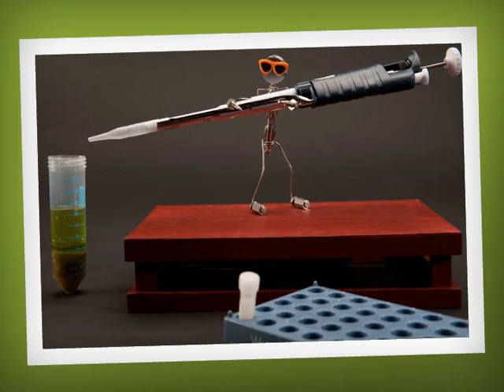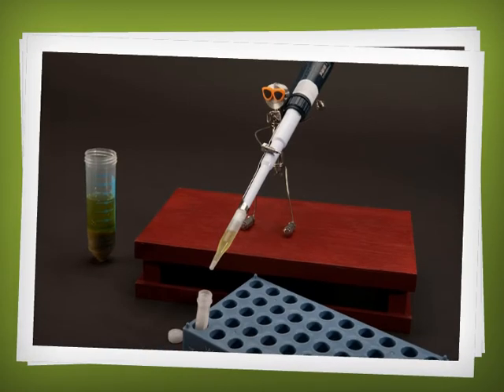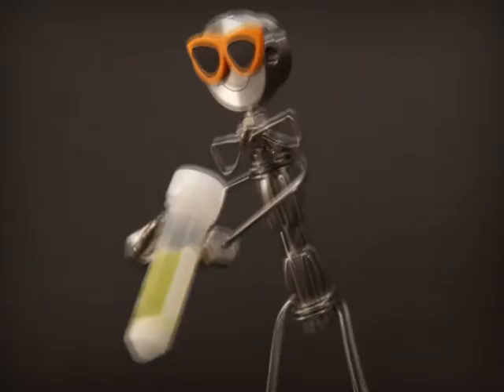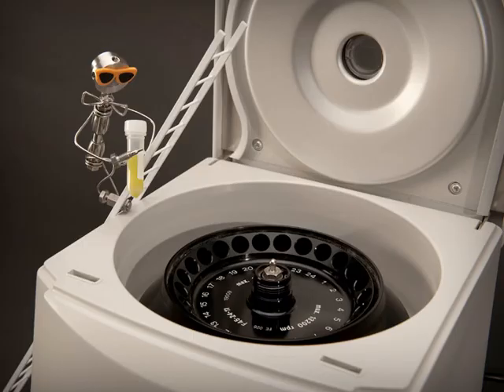Let's add one milliliter of the extract to the small cleanup tube — we'll call this Tube 2. This tube contains the sorbents and buffers that will further clean up your sample. Sometimes you'll need more sensitivity; Waters also has a 15 milliliter cleanup tube that accommodates up to 6 milliliters of extract. Shake vigorously until the sample and sorbents are mixed.